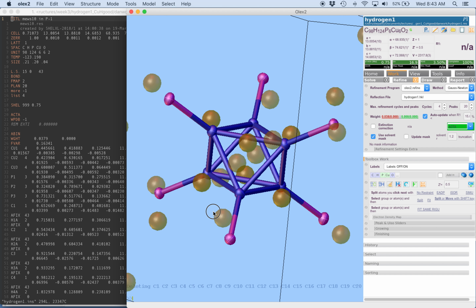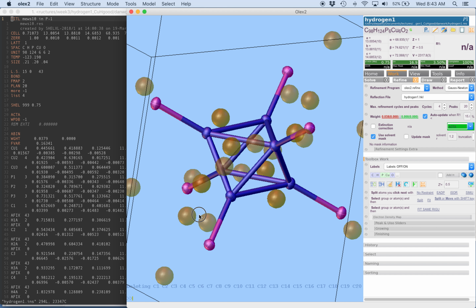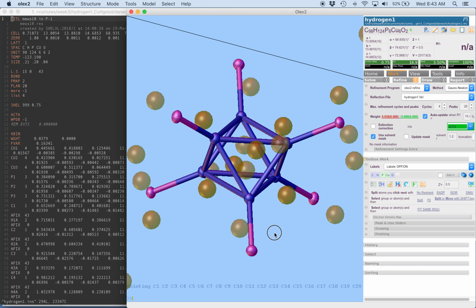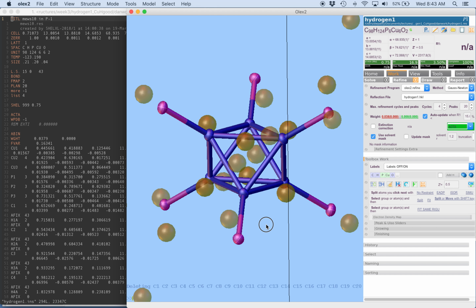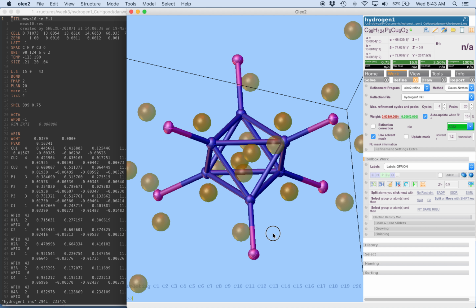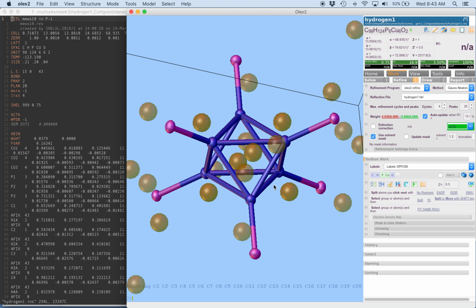We're looking at them in the difference map, and the first thing we can try is just putting them right in there and see how they refine. We won't overthink it too much. We'll just put them in and run a refinement and see what happens. Now remember that 3 out of these 6 Q-peaks that we're looking at are generated by symmetry. So we want to use the original 3 out of those 6. So we're going to see which ones those are.